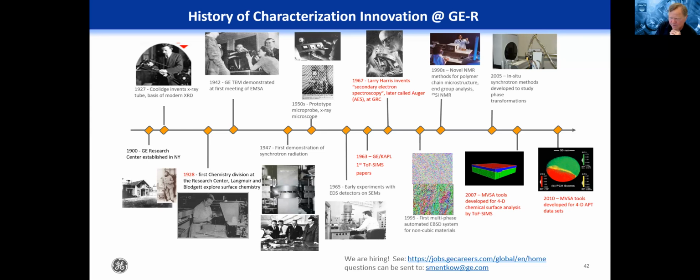They're coming to meetings to soak up information. As far as what I envision, I would envision more hybridization of Auger instrumentation, and that's starting to happen. So I would say it'll probably stay kind of steady state-ish, maybe a slight increase. I don't think it's going to go away.